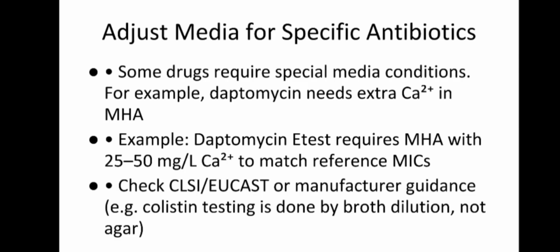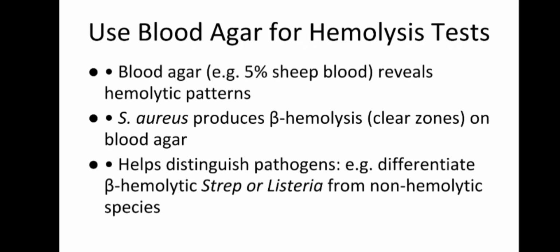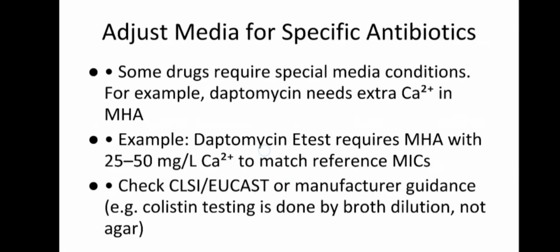Okay, some drugs require special media conditions. You can see the interesting case is daptomycin. It needs extra calcium to be activated, because daptomycin in physiological conditions, while acting on our body, uses calcium to exert its effect.